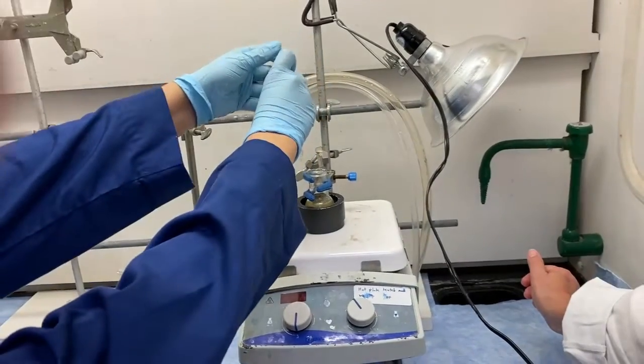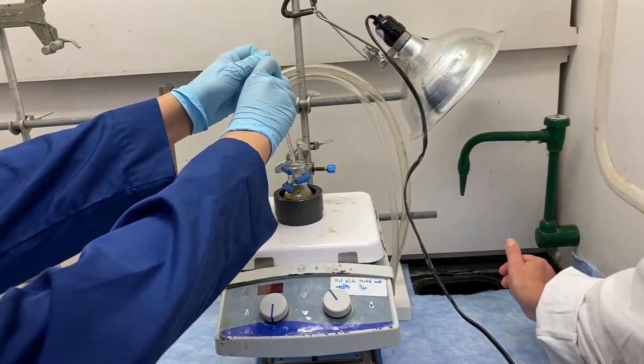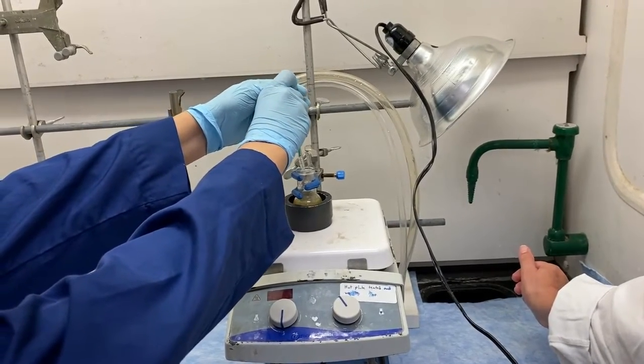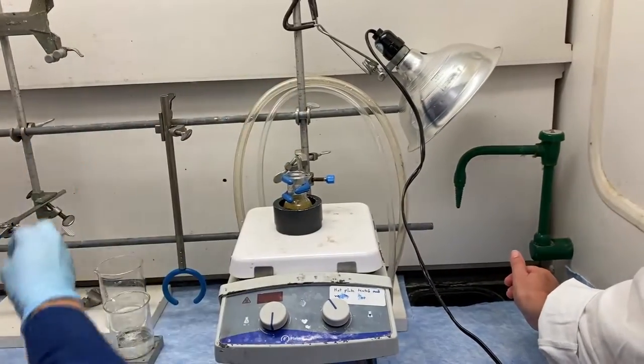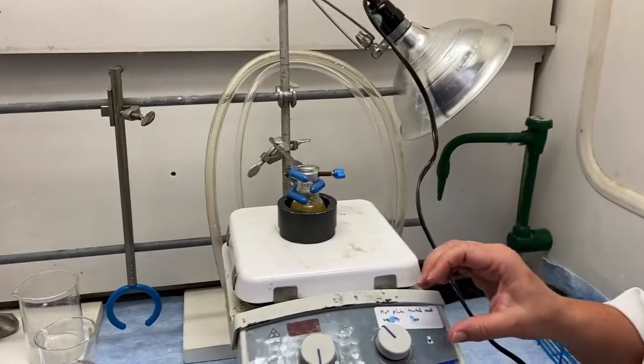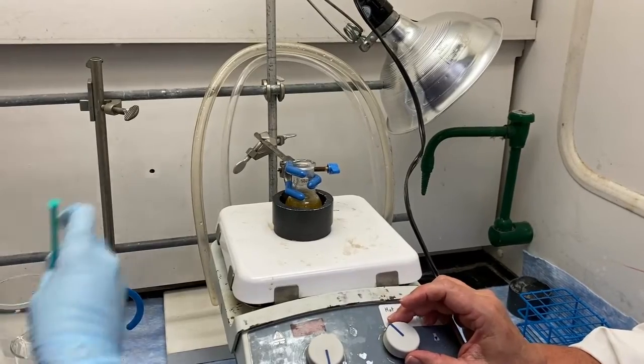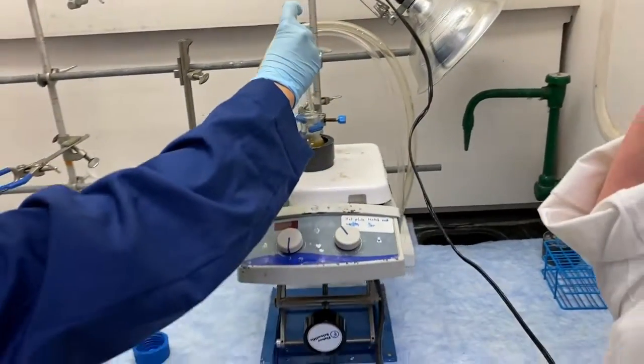Go ahead, I think you're good now. Yeah, it's all gone. That's a good way to know if you have any excess sodium borohydride. So now we've protonated.